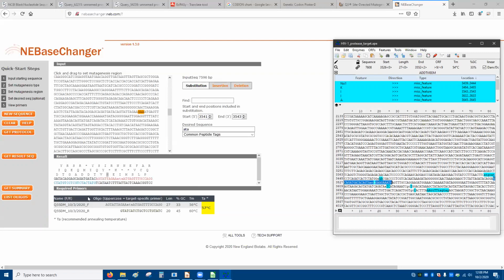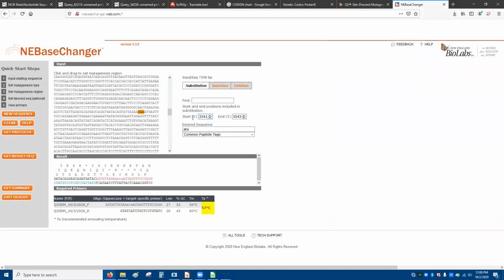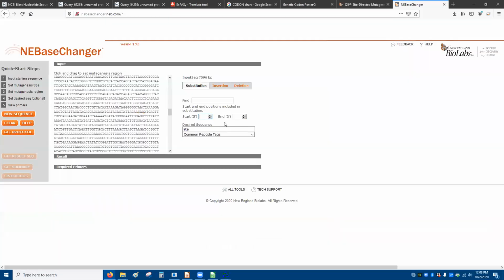So ADD. Ah, I see the issue. Okay. So the reason is this has my tag included here. So I need to subtract 6 from each one of these. So we can do 1, 2, 3. Great.